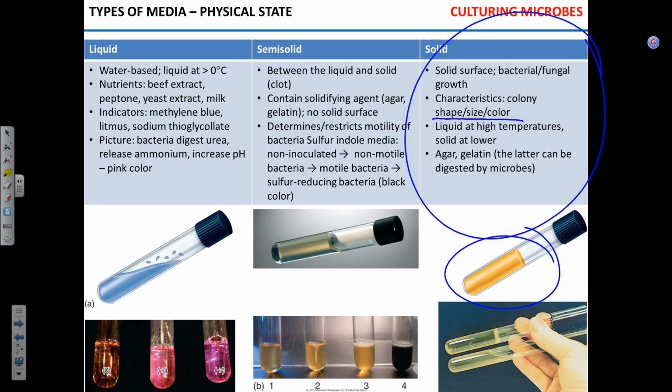How do we put this solid medium together? I can tell you. With a big glass flask, we throw all the components in the flask, pour water, and stick it in the autoclave. The autoclave is right behind that wall.